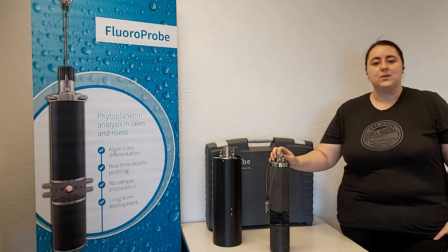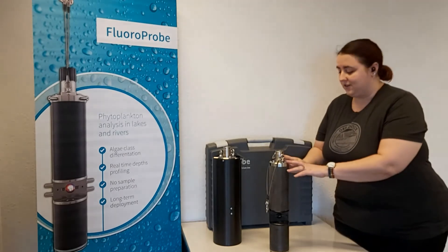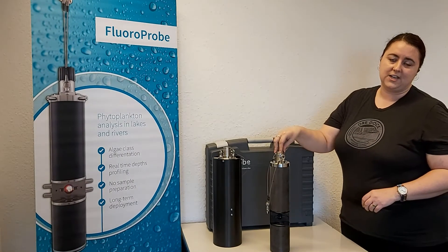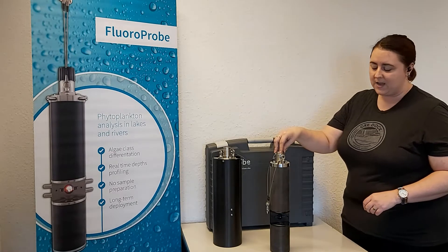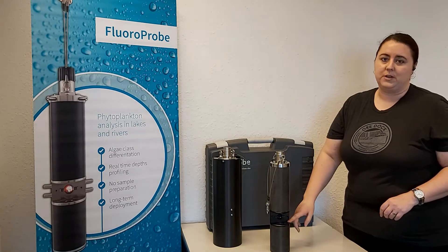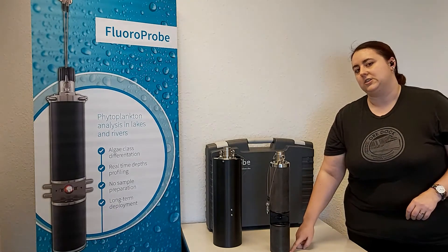The FluoroProbe also has a pressure and temperature sensor. Just to point out a few features on the instrument itself: up here at the top is the plug where it would connect to data cables or a power supply. Here in the middle is the measuring window where the actual measurements are being taken. And down at the bottom is the pressure sensor.